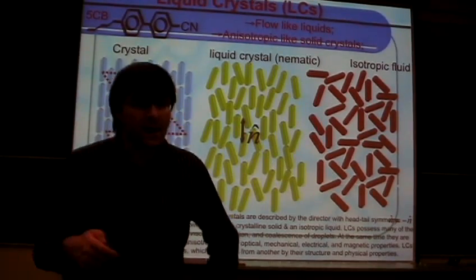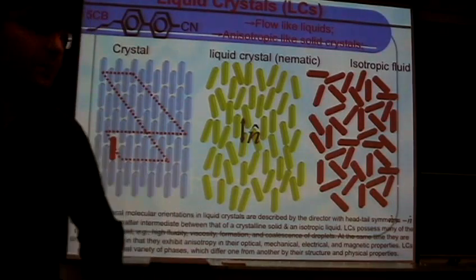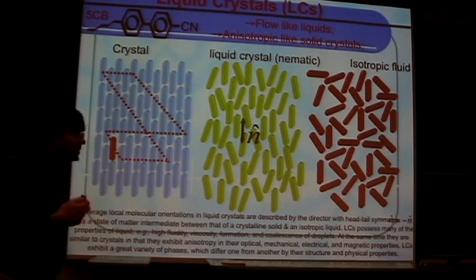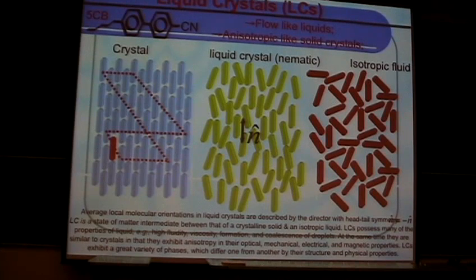So within the second part of the lecture, I would like to show you more detailed examples of application of the confocal microscopy technique to image molecular orientation patterns in liquid crystal materials.